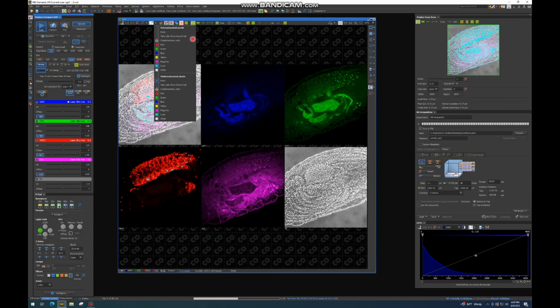So what I'm showing you here is looking at pixel saturation. You can tell the computer to show which pixels are saturated with this here, and I have mine selected to cyan. It is important to strike a balance between saturated pixels and unsaturated pixels so that you get a holistic viewpoint of your sample.